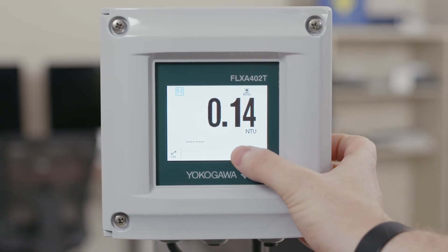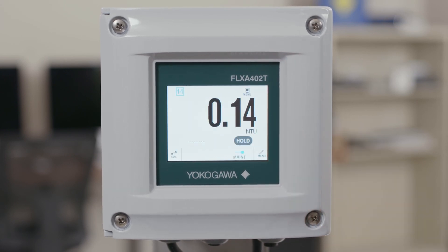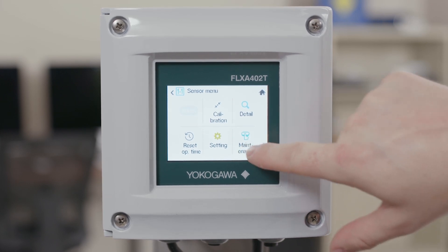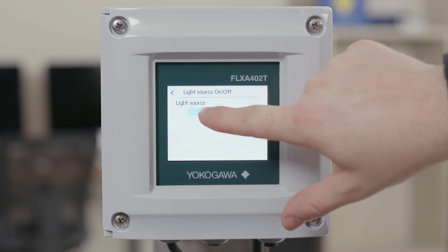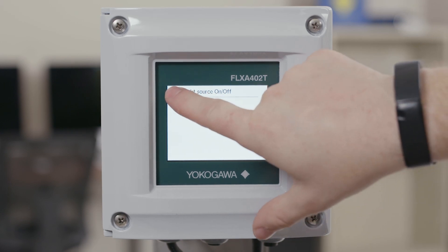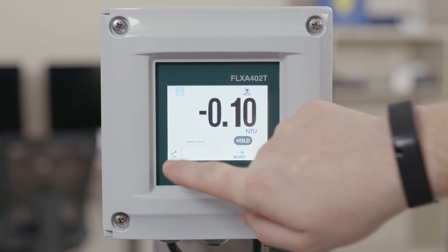First thing you want to do when doing a zero calibration is put the analyzer into maintenance mode. First we'll cover the light off calibration. Go into the sensor menu and into maintenance and you'll see a light source on/off toggle. Click that and the light source will be turned off. Once on the home screen, hit the calibration button in the lower left hand corner and select zero calibration.